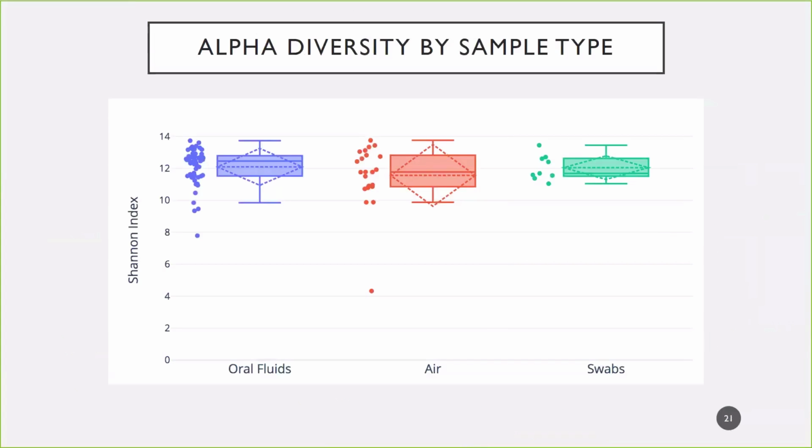So we also wanted to look at alpha diversity by sample type. So this is the diversity within. So along the y-axis, we have the Shannon index as our alpha diversity metric. And along the x-axis, there are the different groups of sample types, so oral fluids, air, and swabs. We didn't see a significant difference between the diversity within each sample type, though. Next slide.